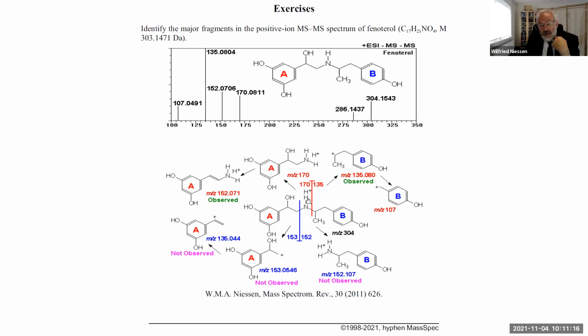So it takes the hydrogen from the nitrogen. And that means that you will have a 3-membered ring here, which blocks the cleavage at this side. Yeah. So interpretation is okay. There are some additional details in the spectrum, and I would say that's the reason why the spectrum is there as an exercise.